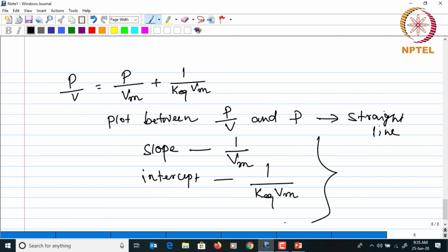Okay, so this is the Langmuir isotherm, which talks about the formation of a monolayer on a solid surface. And from that, the BET theory can also be explained. So in this case, we are talking about the monolayer, but this can also be extended to multiple layers, which is actually the case for the BET theory, and that is what we are going to talk about next.